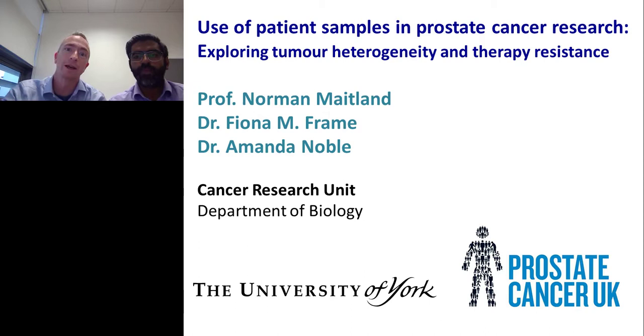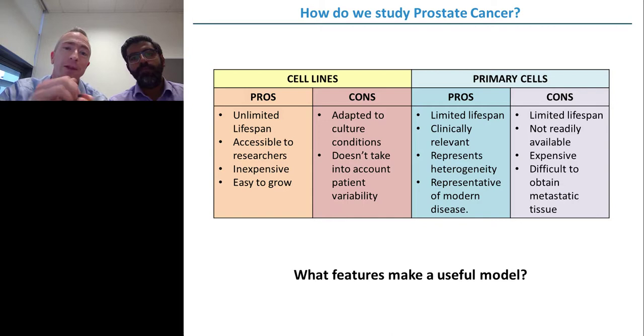And actually, I'm only going to show you one bit, which I think really highlights the importance of understanding and getting these metrics out of the cells. What they're really good at is using human patient cells, primary prostate cancer cells. You don't want to think about how they get them.